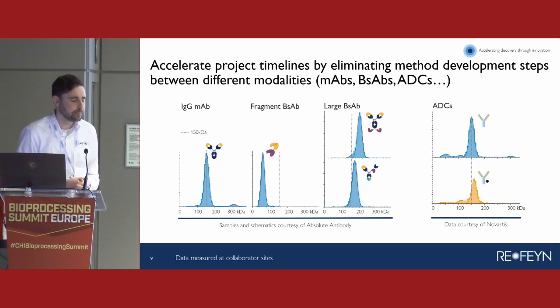Yes, I have a question about dilution. Sometimes you have to dilute the sample, and one of the points I see is, can you really mimic the formulation conditions, because that sometimes is not always easy.